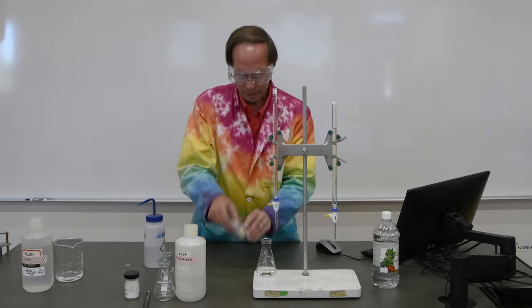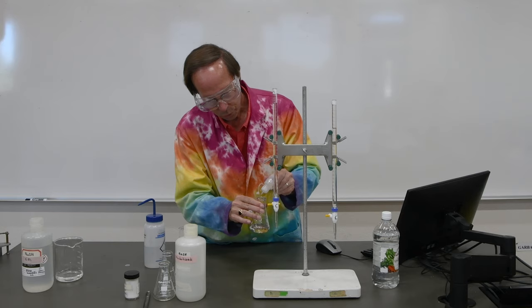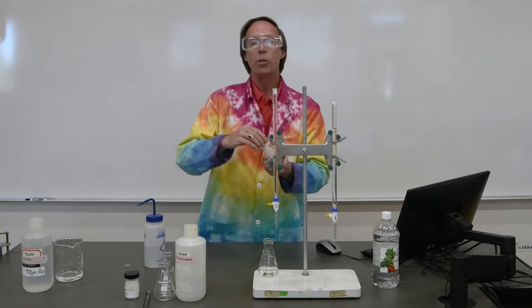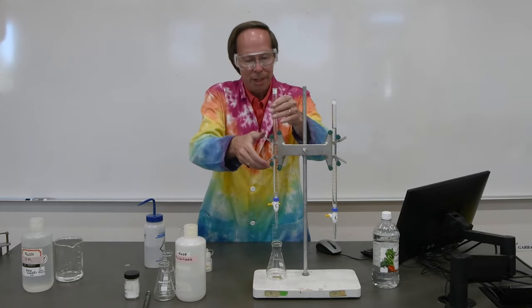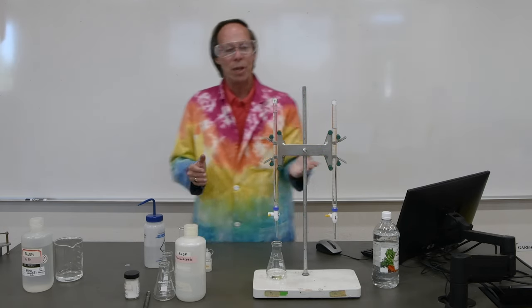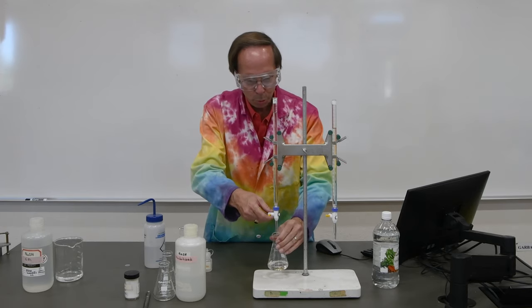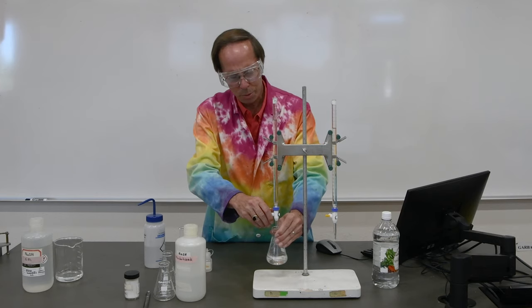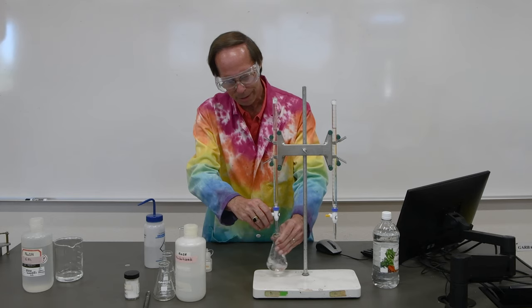Let's go ahead and add some phenolphthalein indicator. So we'll put in a few drops of phenolphthalein, and of course it's colorless because vinegar is acidic. And now let's go ahead and begin the titration. Since we don't know where the endpoint's going to happen, I'm just going to add it fairly quickly. And as soon as it turns pink, we will stop. We'll get a reading then, and we'll figure we did overshoot a bit, but now we'll have a pretty good idea of where to slow down in the next trial.